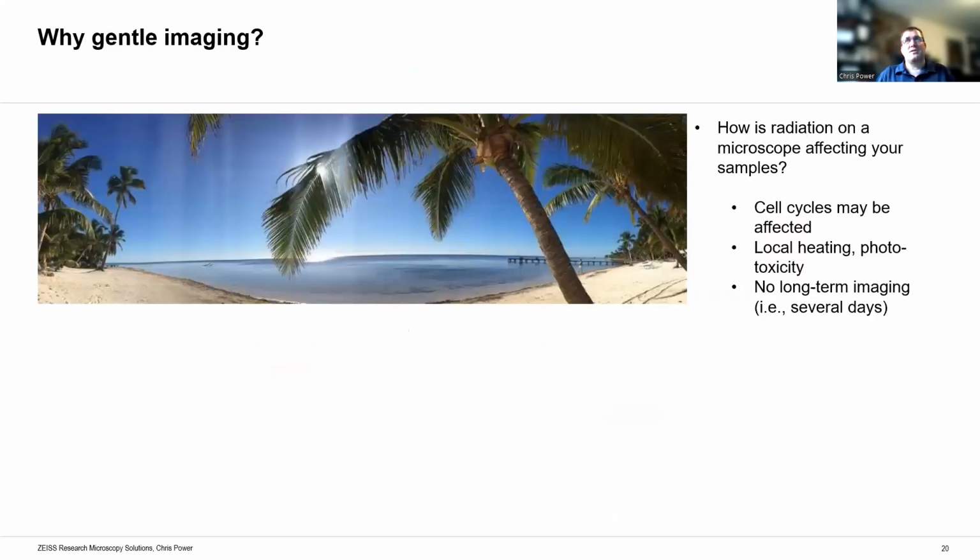And just to illustrate that effect, if you think about a 1,000 by 1,000 pixel image, with a confocal, you put all of your light on 1 pixel, so a millionth of the pixels for a millionth of the time. So you have to be a million times brighter to get the same average intensity. And to do a crude analogy, if I subject you to light, would you like a millisecond near the surface of the sun? Would you like 3 hours outside in Jamaica at noon? Or would you like a month in a basement with a candle?